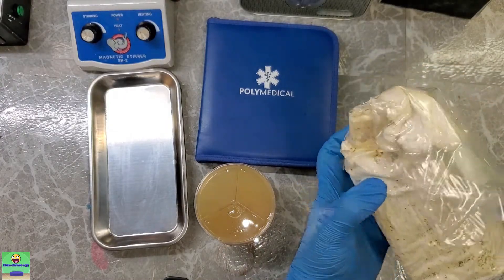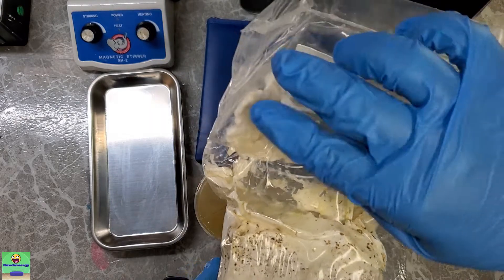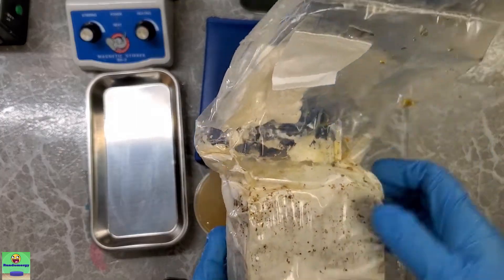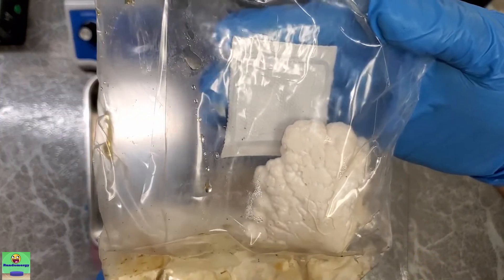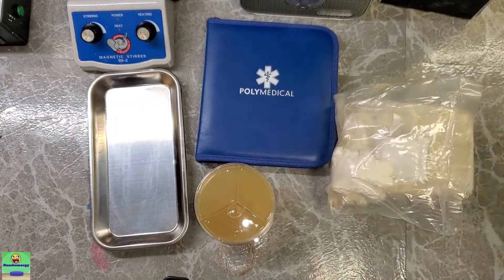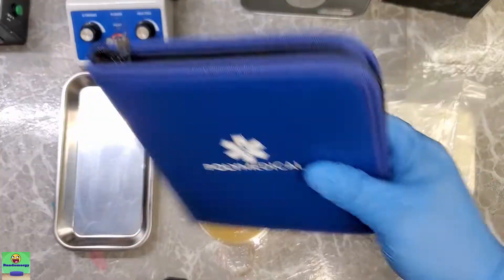Holy crap, look at that — there's a huge chunk of mycelium right here. That's where we're going to take our samples from for cloning. I'm just going to put that there and get my scalpel out.